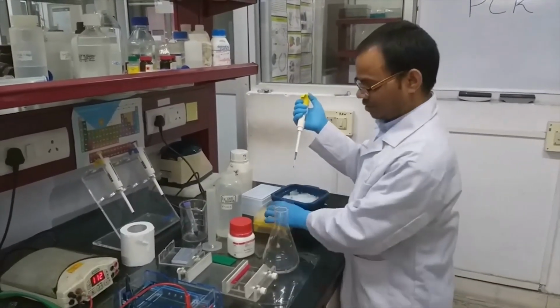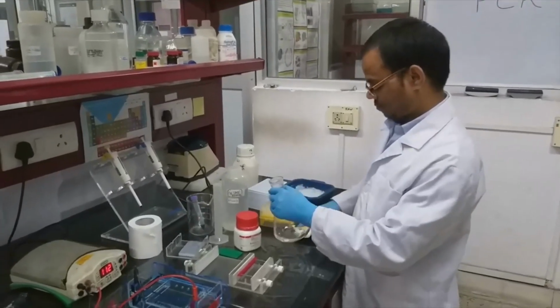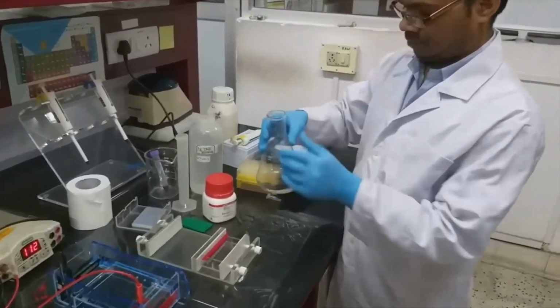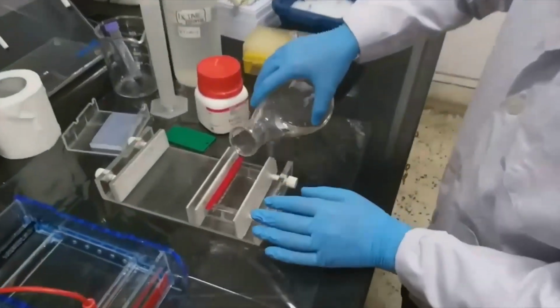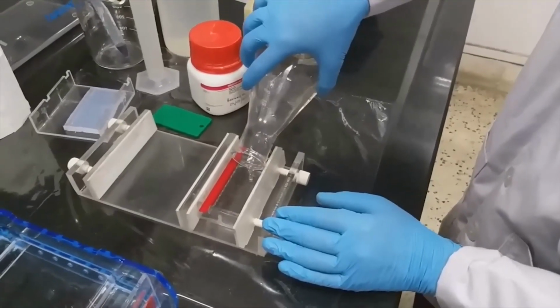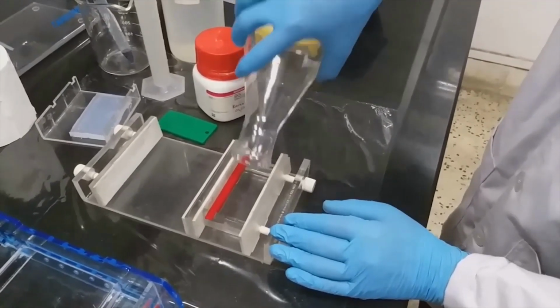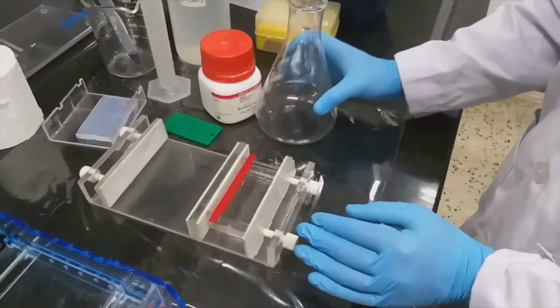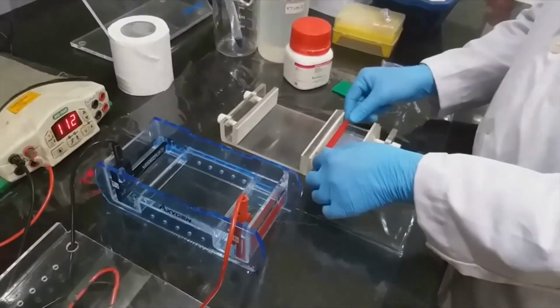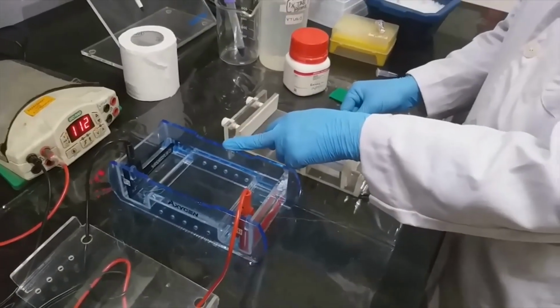Now before pouring, we have to add ethidium bromide for detection purposes. Now the gel has solidified. We have to take out the gel and keep it in the electrophoretic apparatus.